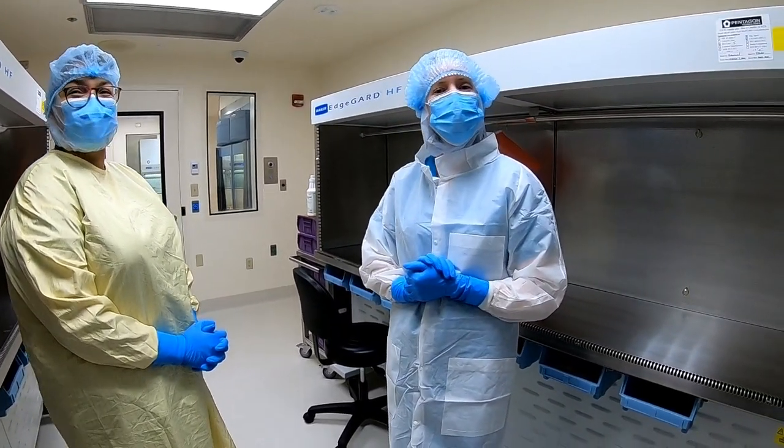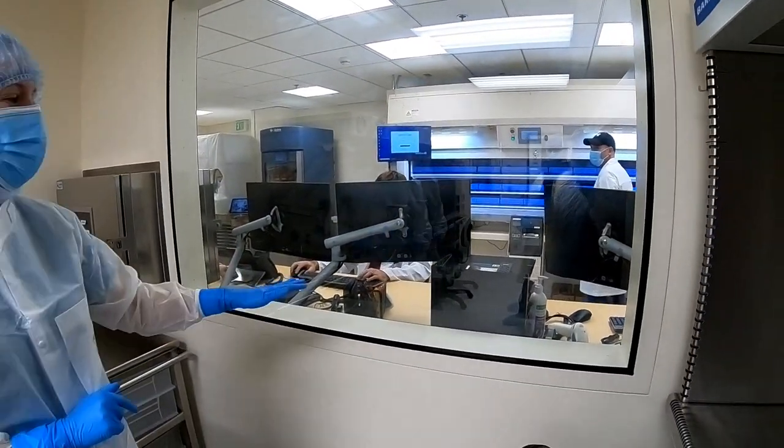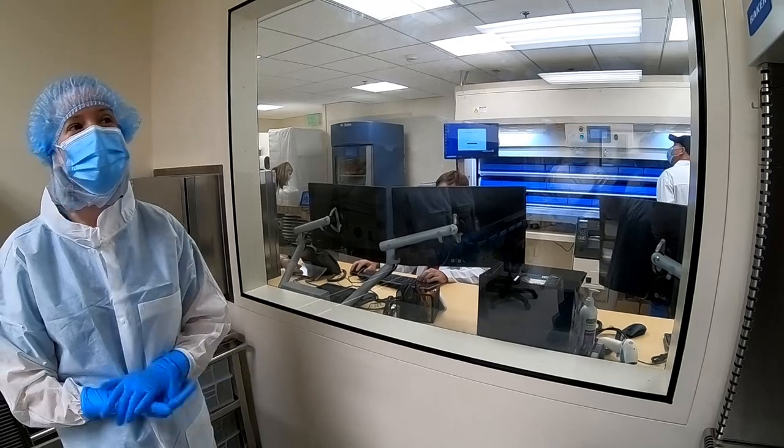The pharmacist will be able to see staff while they're working. Yes — the pharmacist will be monitoring you at all times and will be able to see what you're doing.